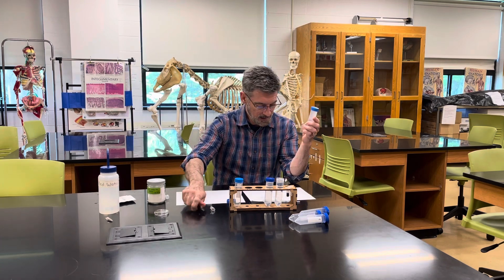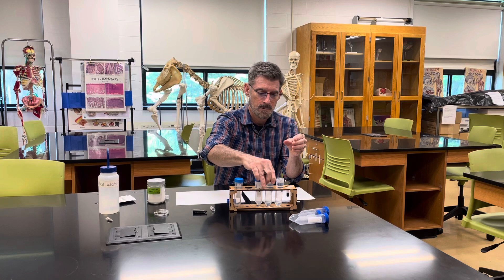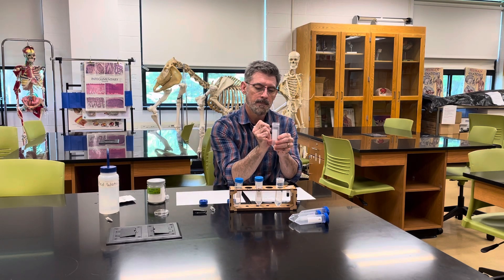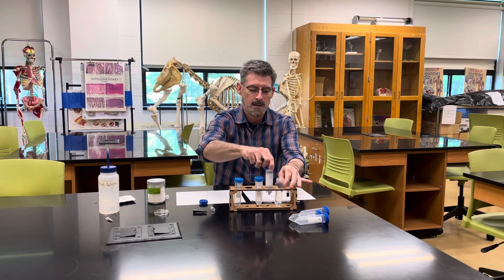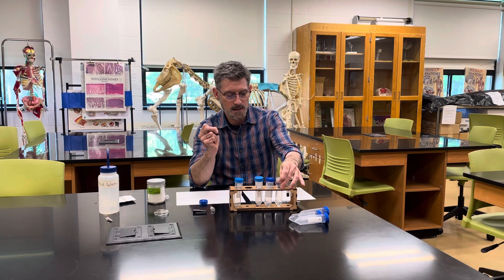Next, you should label these containers. I'm labeling this one with three-quarters teaspoon, this one with one-quarter teaspoon, and this one is the zero — pure water with no salt added at all.